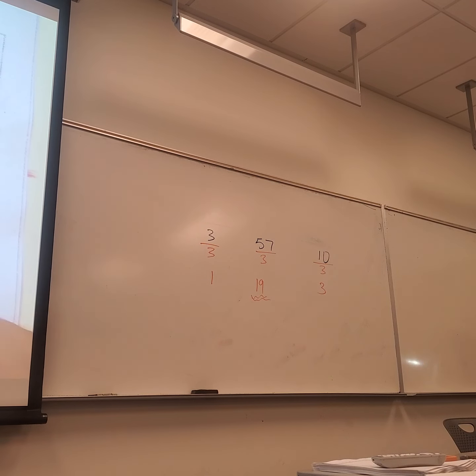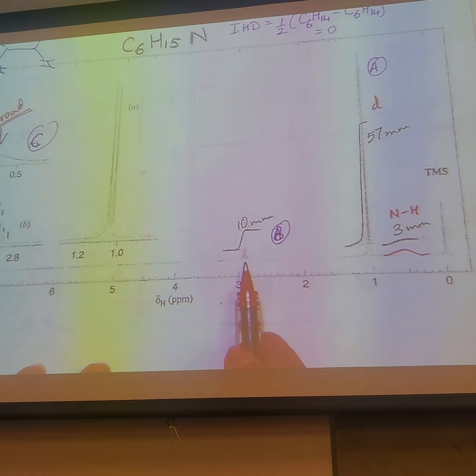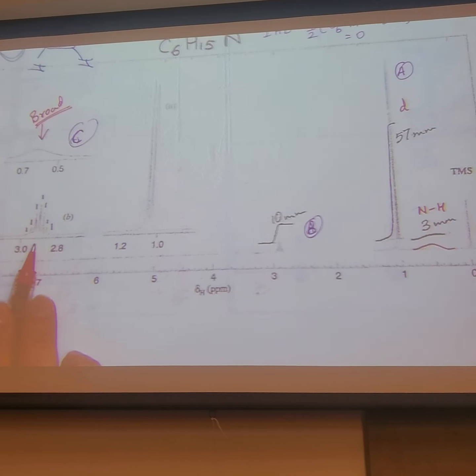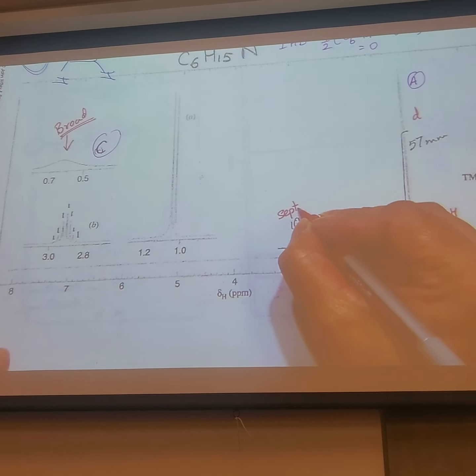Okay, now what's the multiplicity of A? It's been blown up here. 2. So that's a double. Everybody agrees? So what's the multiplicity of these? Very quick, because I've been copying these every year. But it's been blown up here. 7. So please think about it.